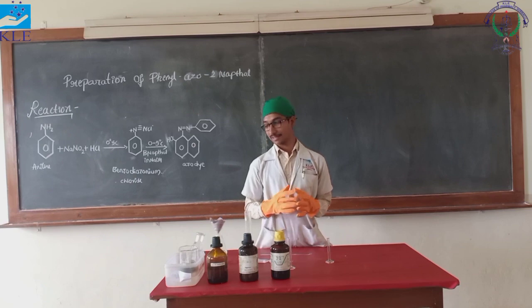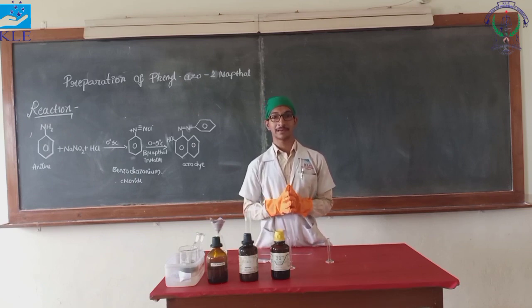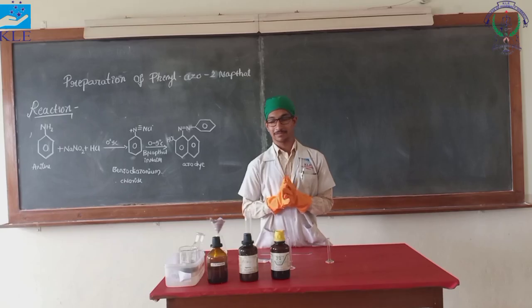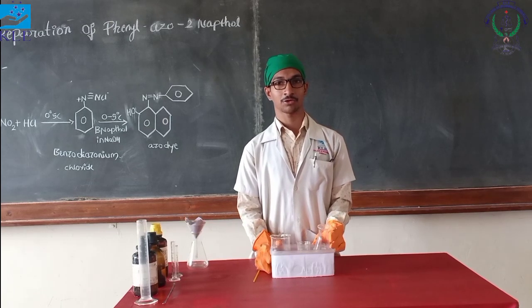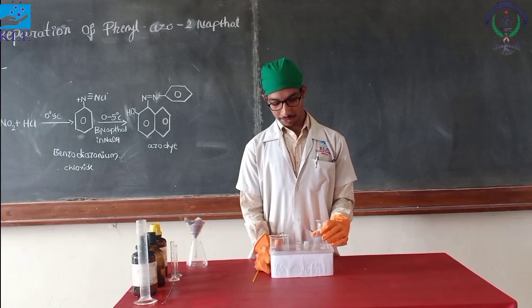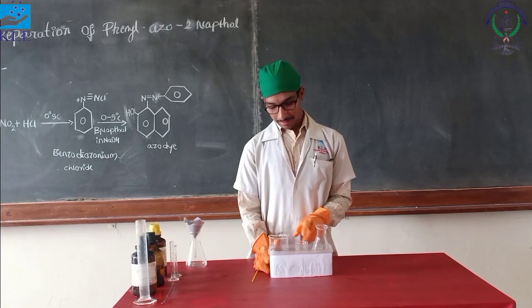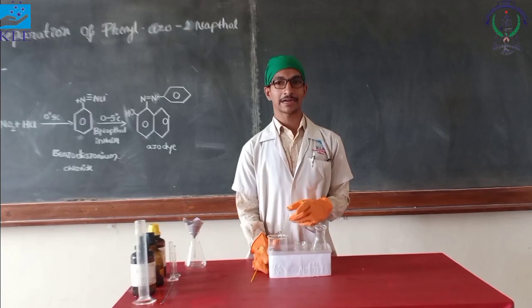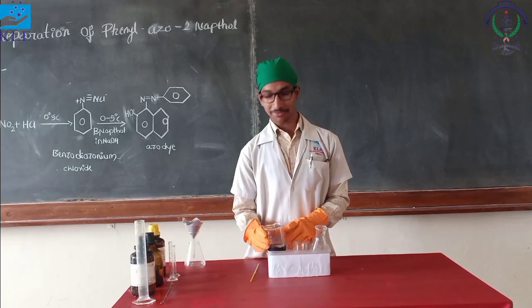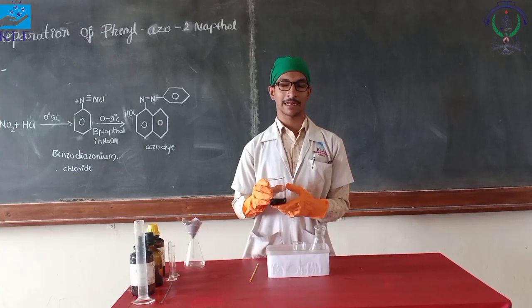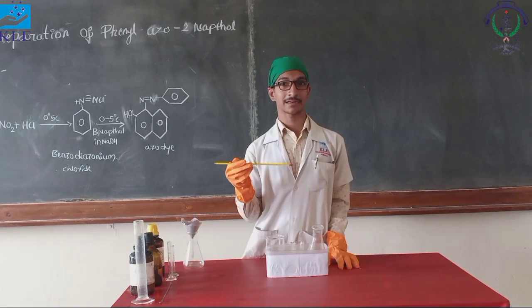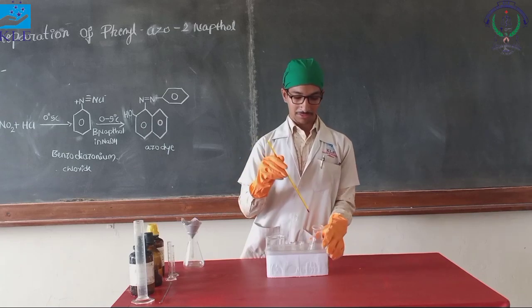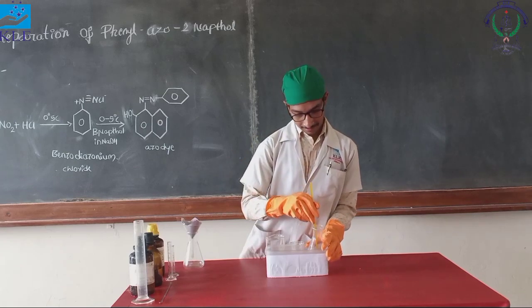As it is an exothermic reaction, care should be taken that the temperature is maintained in the range of 0 to 5 degrees Celsius before starting the reaction. This is the ice bath. I have kept all 3 containers in it: the first is the conical flask containing aniline and hydrochloric acid, also referred to as the anilinium chloride solution; the second is the beaker containing sodium nitrite solution; and the third is beta naphthol in 10% NaOH solution. Monitor the temperature with the help of a thermometer — it should be between 0 to 5 degrees Celsius only.